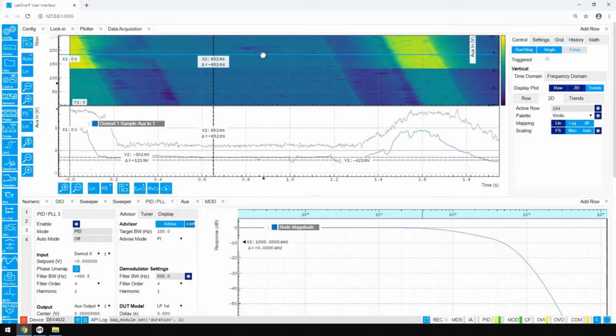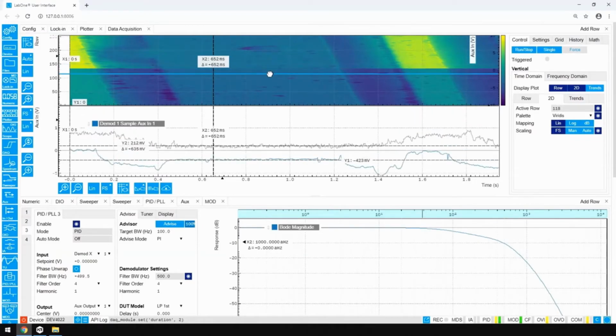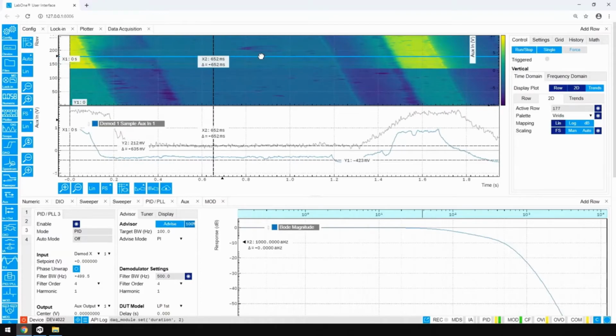When I'm here and here, we should not see this, because this is just grounded, so the CPD should be exactly the same all the time. But it just shows that there is some small offset coming from the contribution of the cantilever. While if I'm sitting on the heterodyne image and I go through this, then it's always the same. So there is no offset due to other contributions. And so if there is no bias applied, then there is no CPD measured.